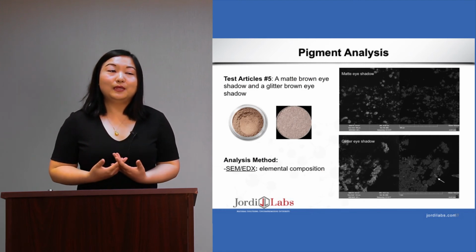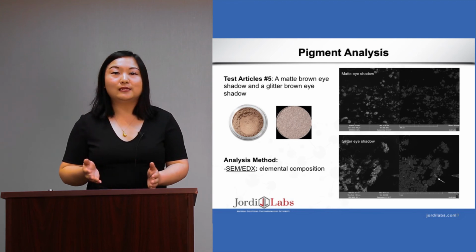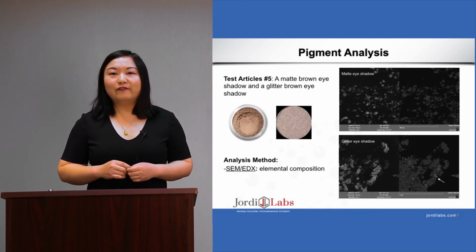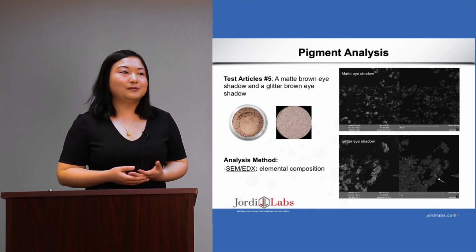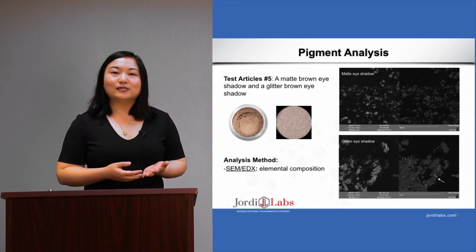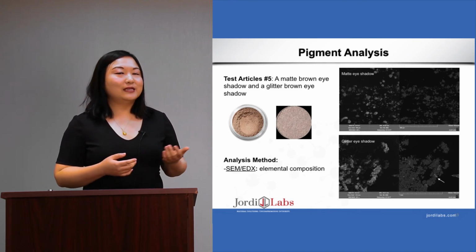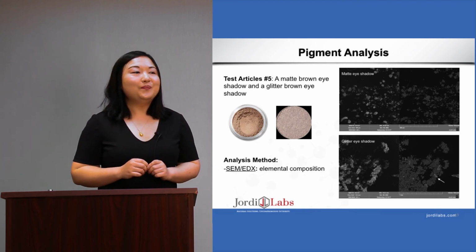Next, let me move to a very special area of cosmetic analysis, that's pigment analysis, because pigment is very widely applied in cosmetic products like makeup. The test articles we use here are two of my favorite eyeshadows. One is a brown matte eyeshadow, and the other is a glitter eyeshadow.